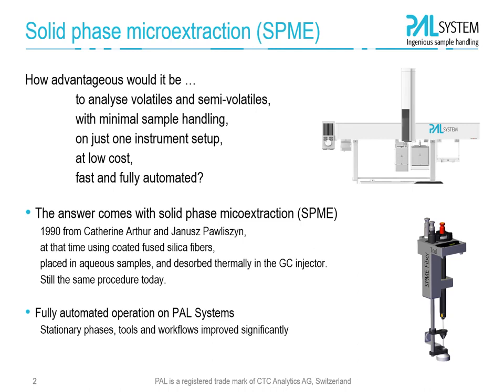SPME, or we call it SPME in our lab jargon, is not new. It was in 1990 when Catherine Arthur and Janusz Pawliszyn used coated fused silica fibers for the extraction and desorption in a GC. The basic procedure is still the same today, but a lot of development happened.